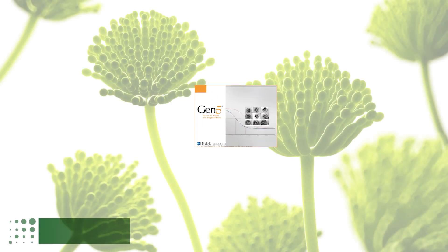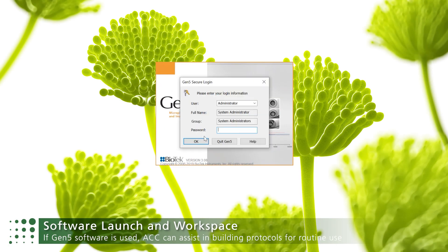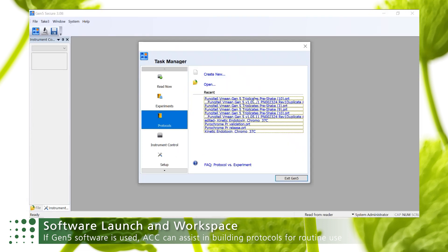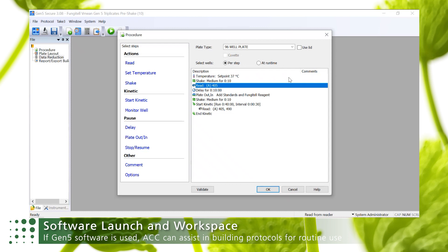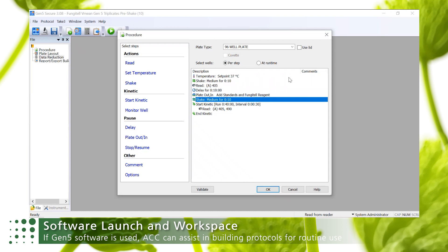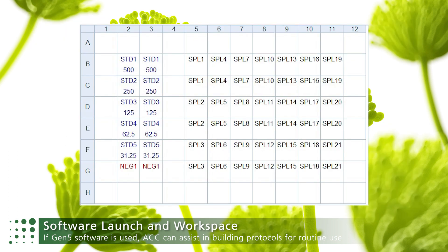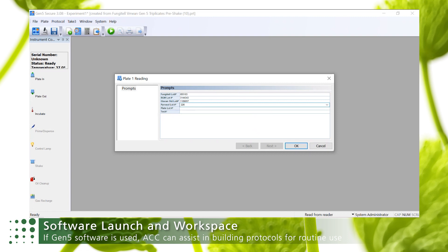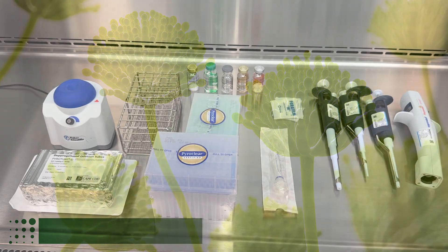Launch the software — in this example, Gen5 by Agilent Technologies (previously BioTek) — referencing specifications from the IFU. Select your Fungitell protocol. In this example we will perform testing on 21 serum samples; the number of samples in an assay can be changed in the plate layout. Enter your sample information and finish software setup by adding reagent and consumable lot numbers.